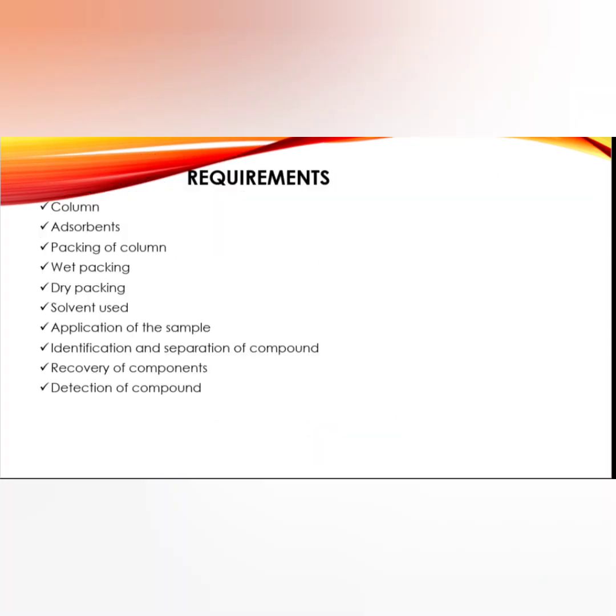And their requirements: column, adsorbent, packing of column, wet packing, dry packing, solvent used. And what are the applications of the samples: identification, separation of components, recovery of components, and detection of compounds.